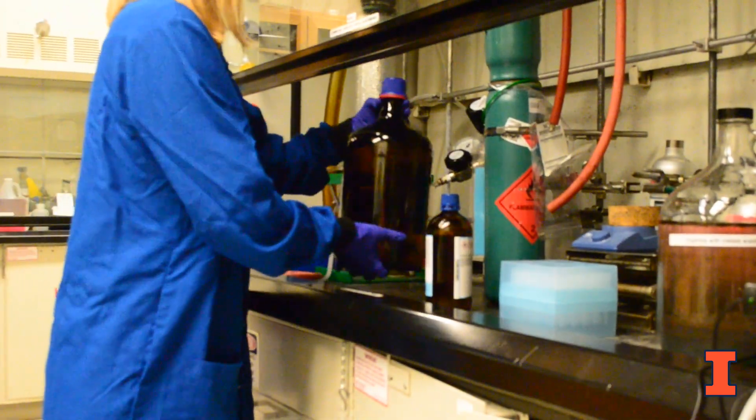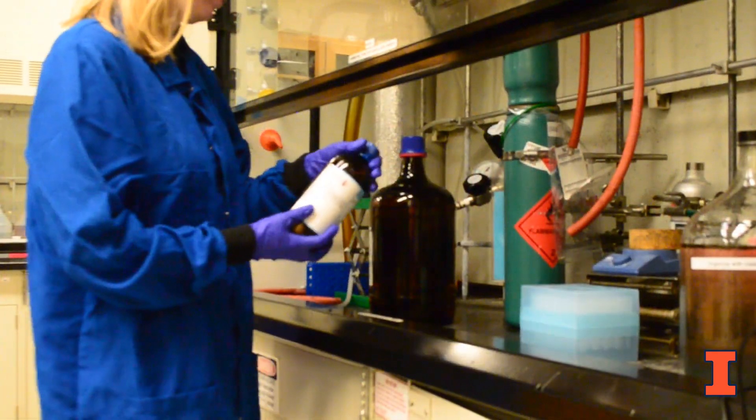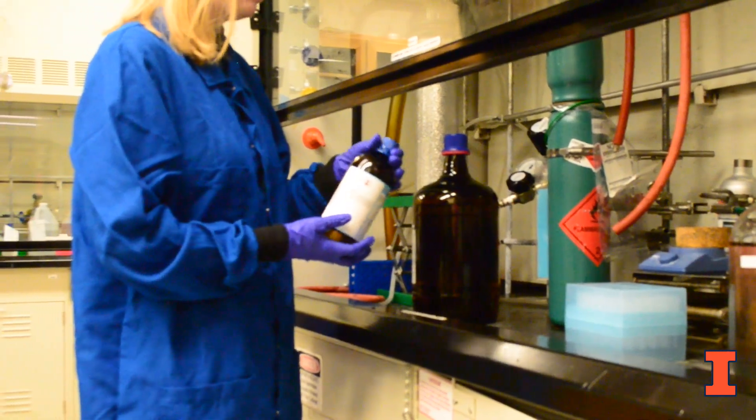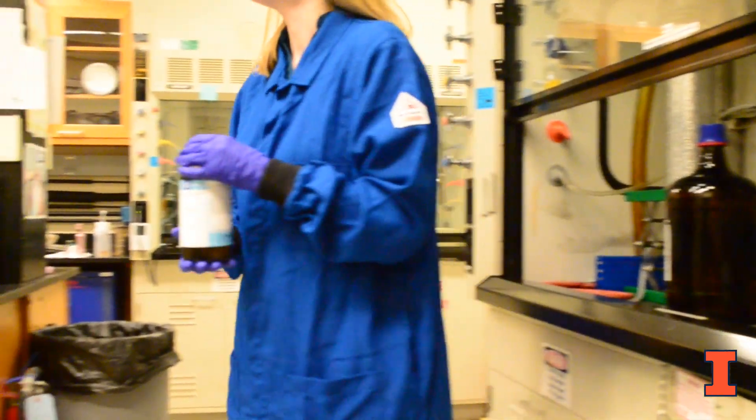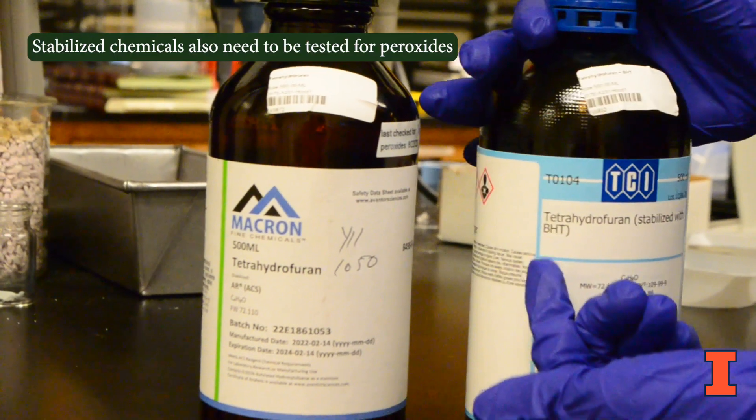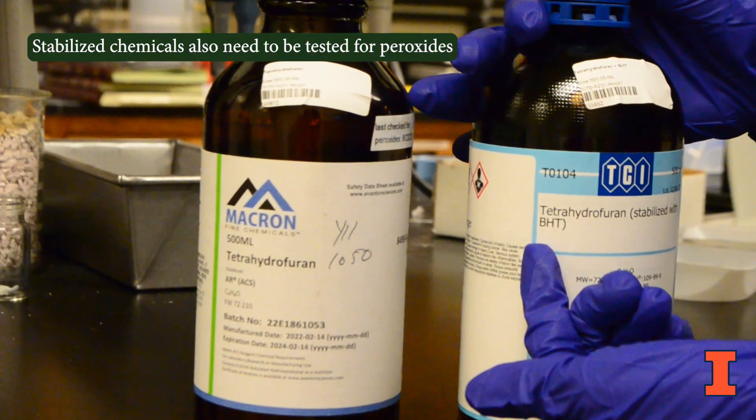Buying smaller quantities of these chemicals that will be used up quickly is another way to manage the hazard. Some peroxide forming chemicals are also available to be purchased with inhibitors or stabilizers added to them.